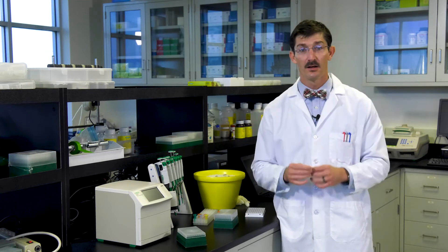So today let's talk about real-time PCR experiments. In this three-part series, we'll show you how quickly you can go from experimental setup to analyzed data using CFX Maestro software. Today we'll be going over how to set up your qPCR run conditions and plate layout. This really is a simple process that can take as little as a few minutes to complete.